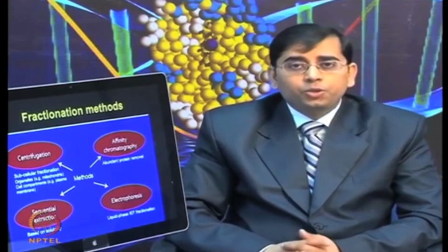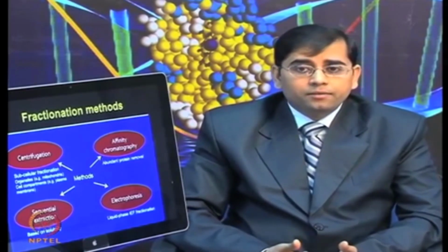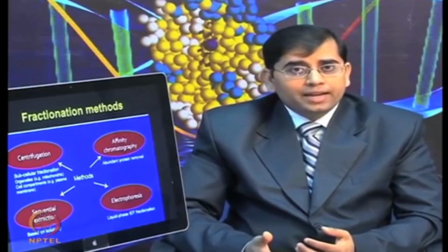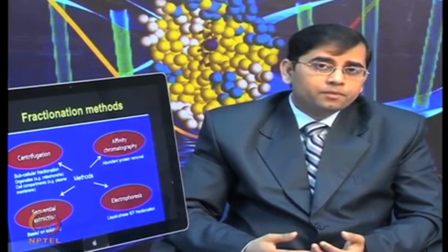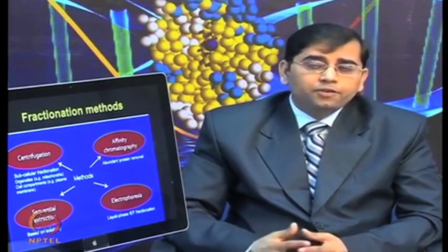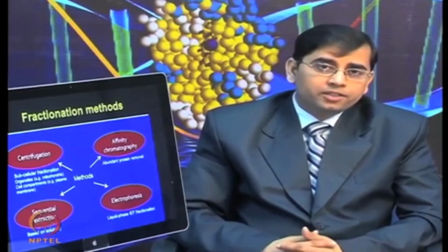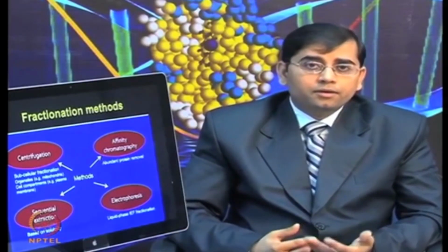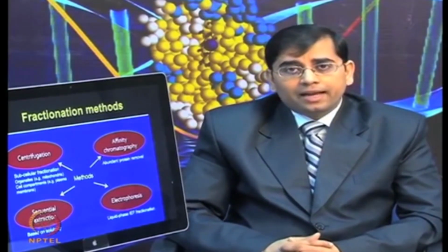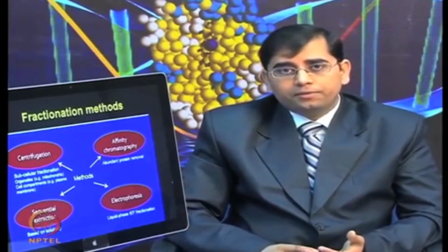Electrophoresis can be used for fractionation. For example, if you are using a gel free method, where you directly want to extract the protein and analyze it using mass spectrometry, then rather than applying the whole sample directly to the liquid chromatography, one can first simplify the proteome by using isoelectric focusing and doing the IEF process in the liquid phase itself. The liquid phase IEF fractionation can simplify the proteome based on the isoelectric point.